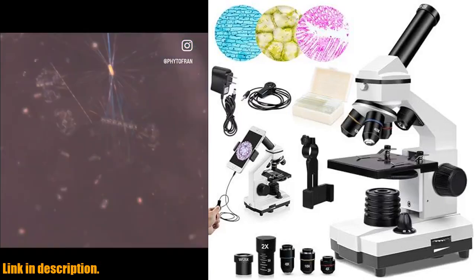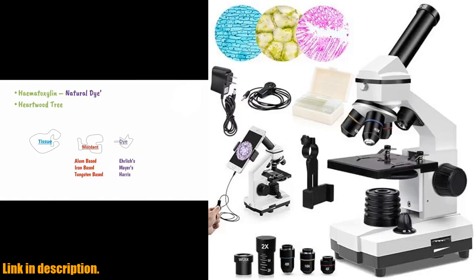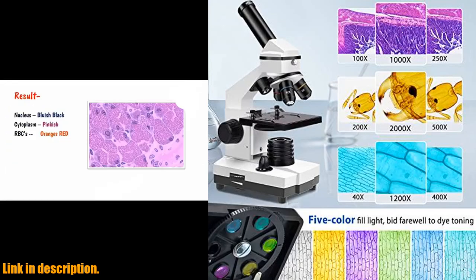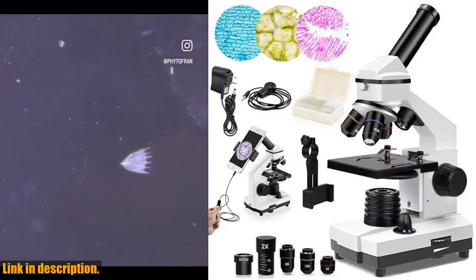Whether you're a student, a teacher, or just a curious hobbyist, this microscope is a practical educational tool that is perfect for school, laboratory, or home teaching. With its solid metal frame and coarse fine focusing knobs, you can ensure precise and detailed focus adjustment, resulting in clearer and sharper images.